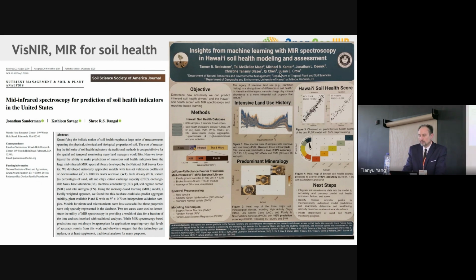But we could also develop these soil health scores, a soil health index, and then we can develop data that goes direct to digital. You just scan it and you say, here's the soil health index. It is possible, but we need to have the training data. You know, we need all this biological data, different lab data. We need a lot of data, and then we can do this.